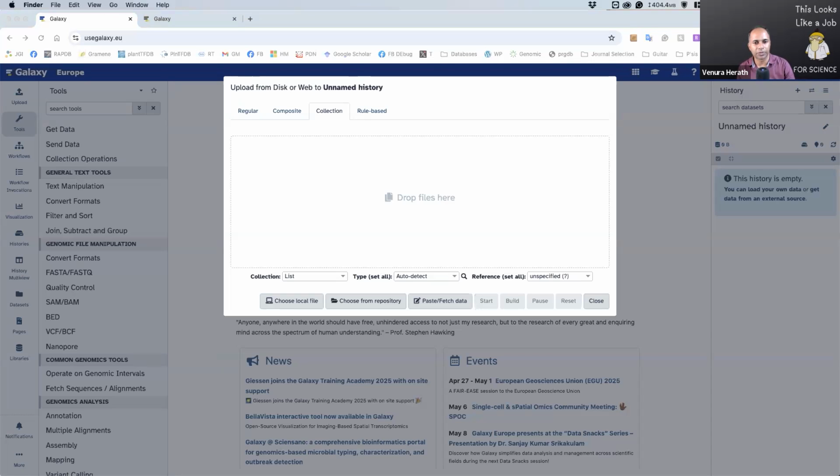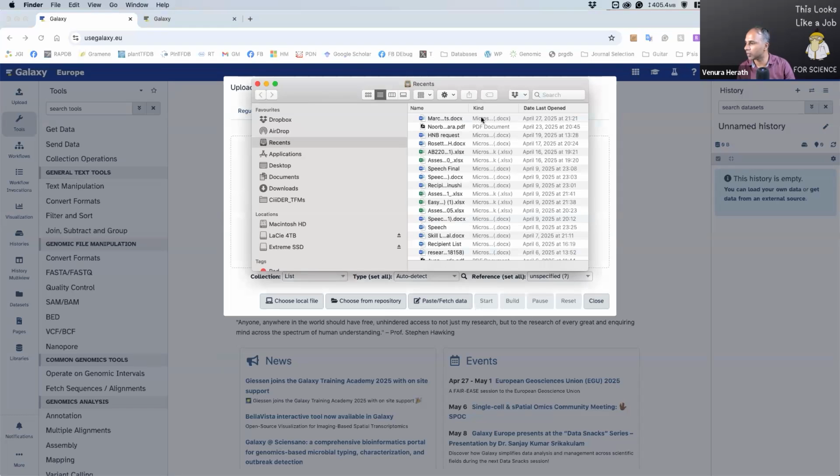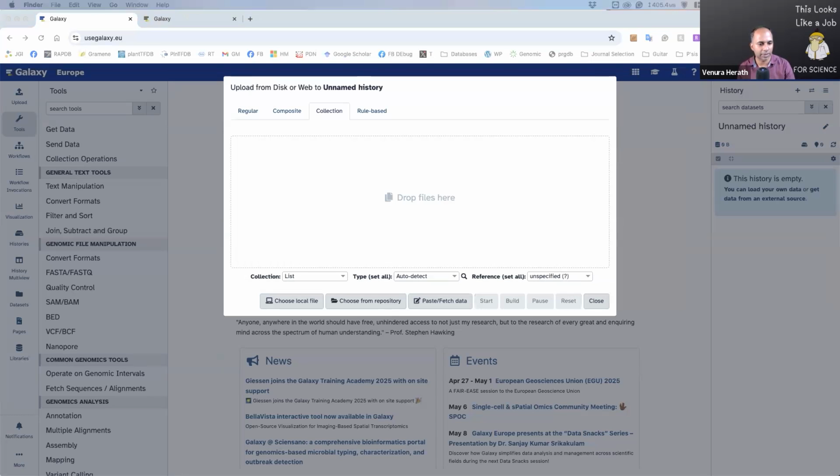Meanwhile, I will show you. Maybe I can upload the file as well. Okay, I think by the yes answers you see both files, right? What you need to do is, let me grab my files and then drop them there first.